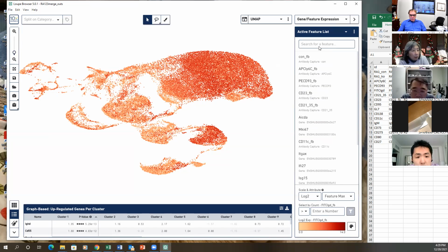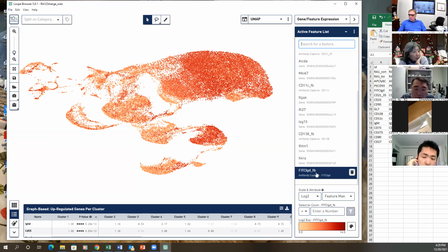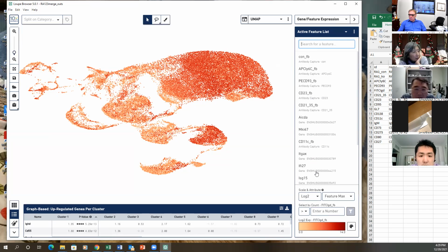The CD21 background is too high, right? The background scale is too high. We washed twice, we didn't wash 3 times. So when you do it, it might be better to wash 3 times. So marginal zone is on this end, FO, transitional.